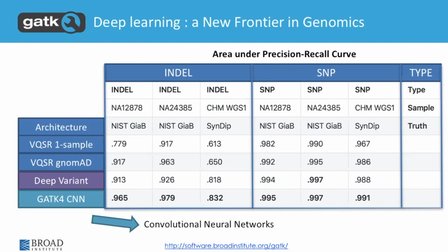I mean, if you think about it in terms of looking at a screenshot of IGV and trying to figure out a germline variant, I would say most people would be able to say whether it's real or not. But with the somatic, it's a different problem. So it requires a slightly more sophisticated solution.